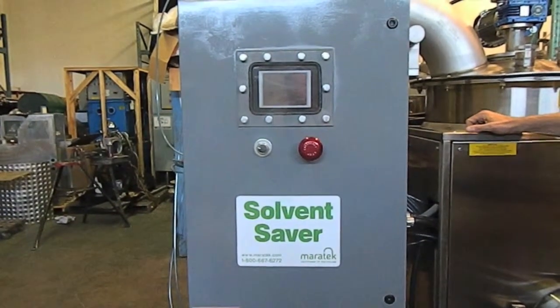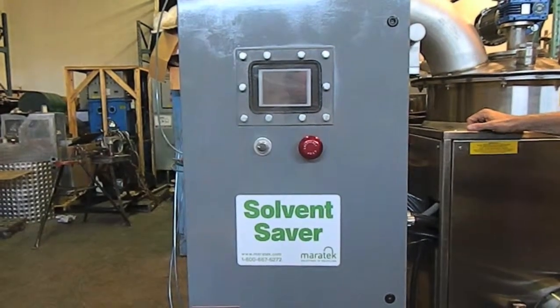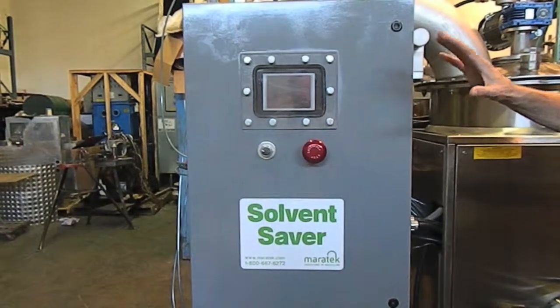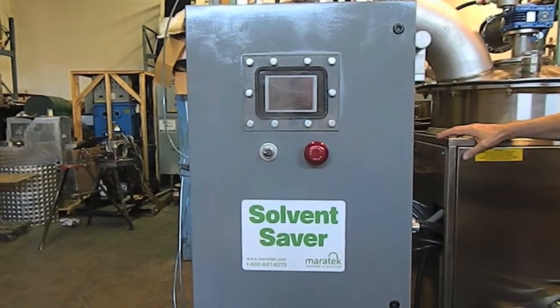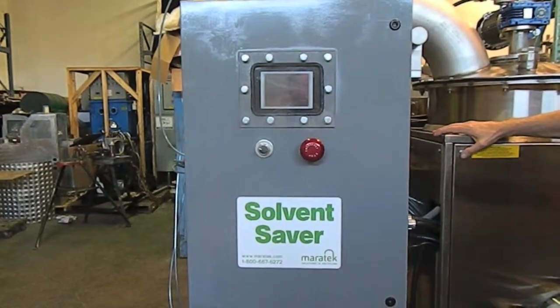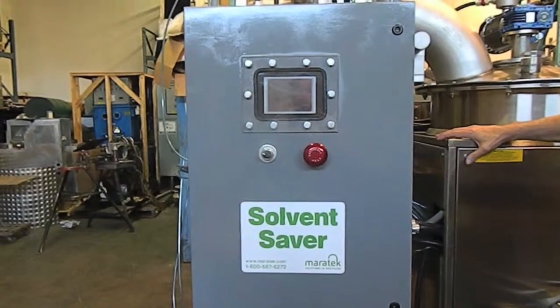All our systems are also MET Lab certified to Class 1 Division 1 for fully safe operation. The control panel also comes with a standard touchpad, but it can also be upgraded to Allen Bradley if you so desire for larger applications.